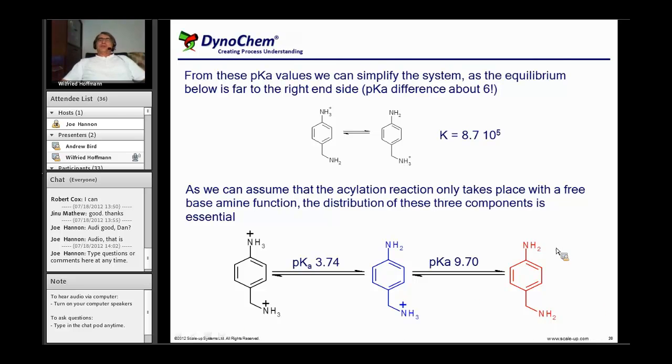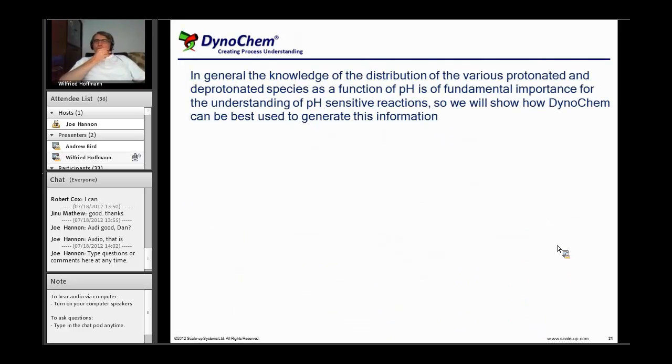This is something very important in general. If you have more complex systems, for example heterocycles with three nitrogens, amino groups, phenols, OH groups, alcohol groups, then probably you can easily account for four or five pKa values to a single molecule. By the method I will show you, it is easy to calculate the distribution of all the different various protonated and deprotonated species.